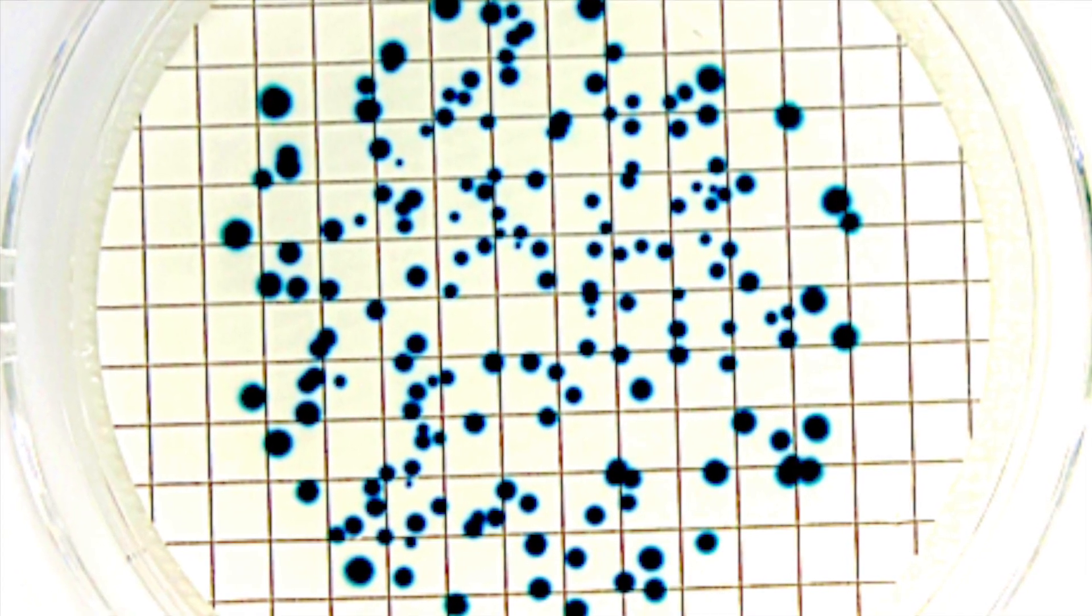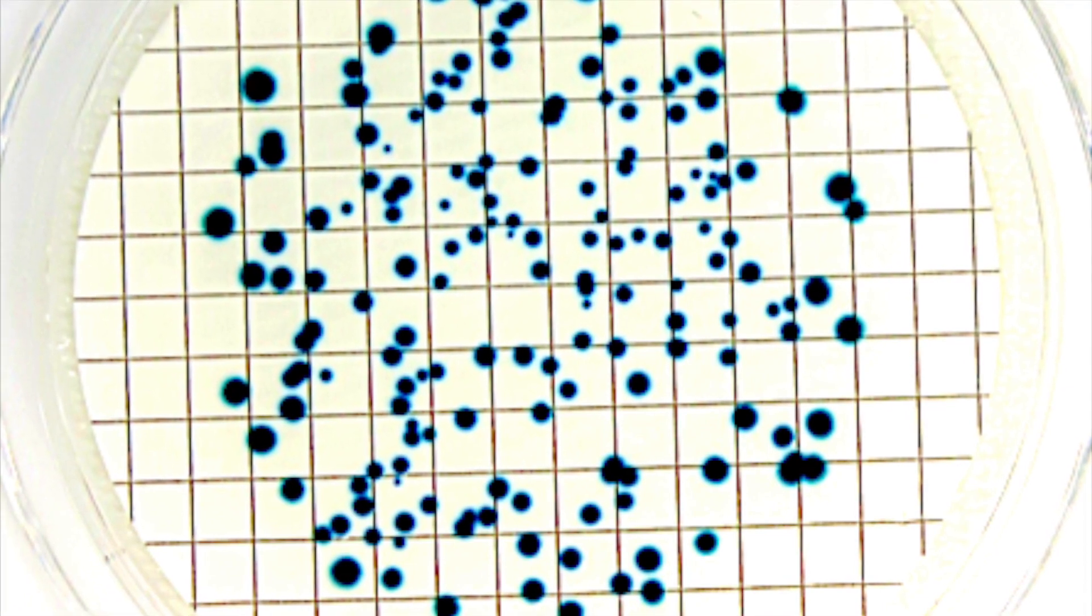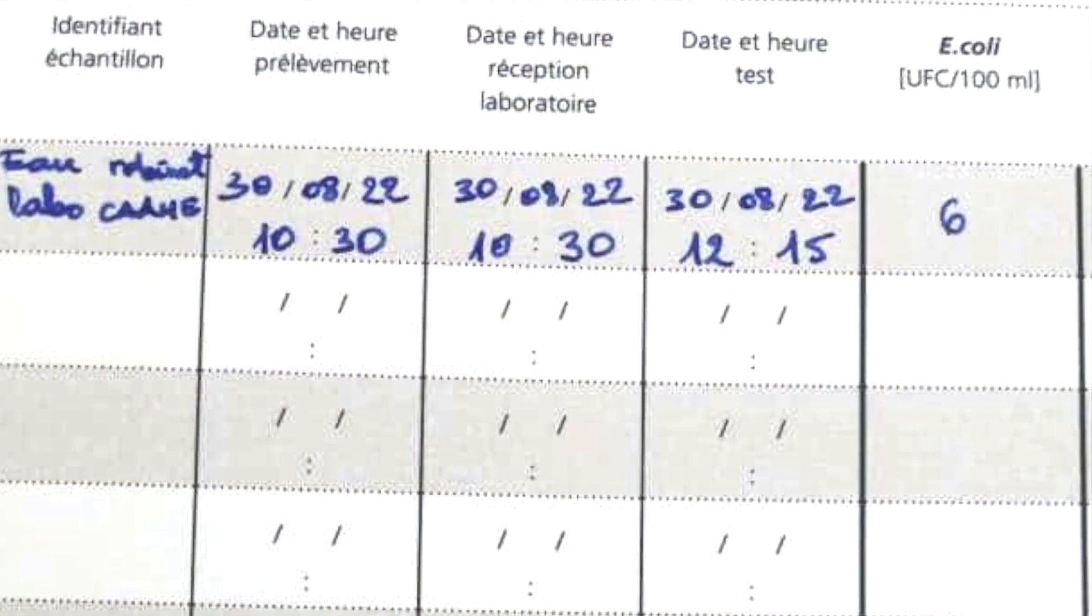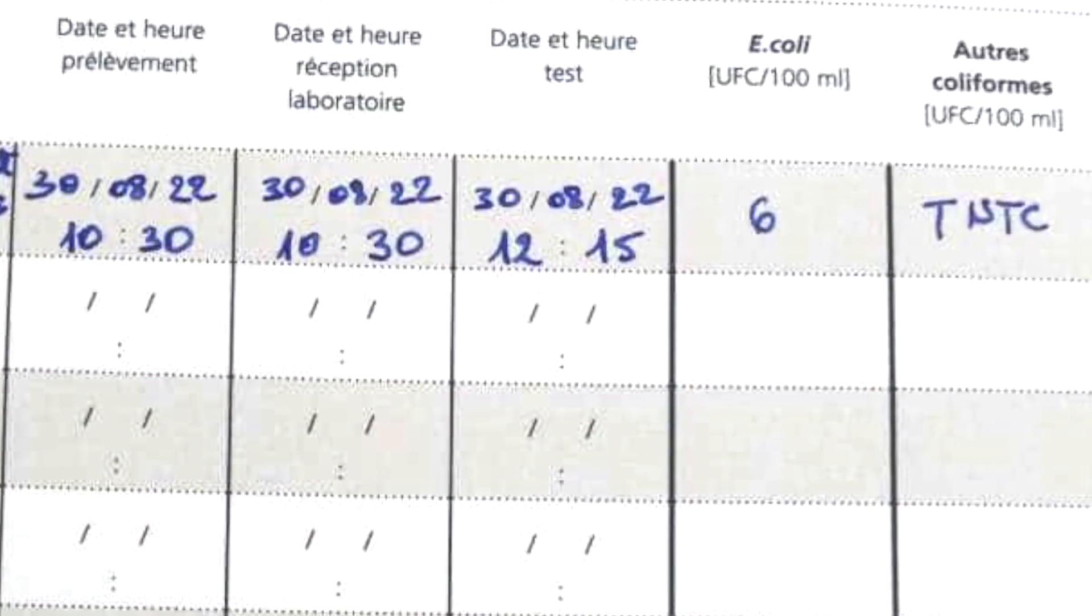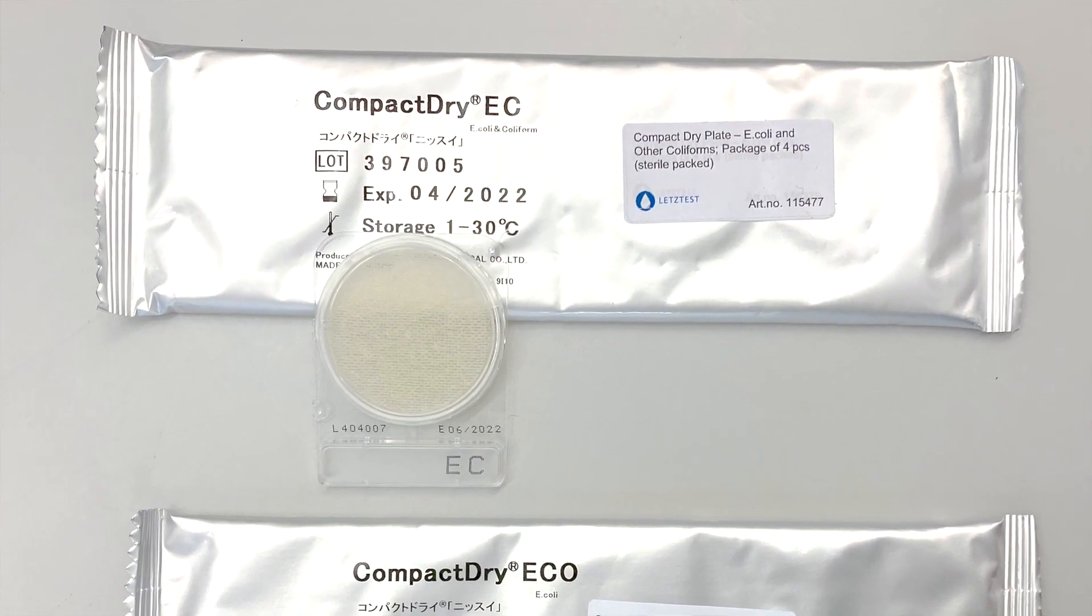If more than 200 colonies are present, the result is noted as too numerous to count. Record the result using the waterproof pen and the re-writable practical manual.